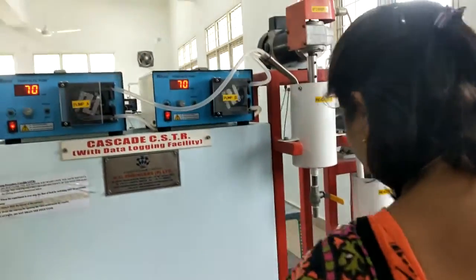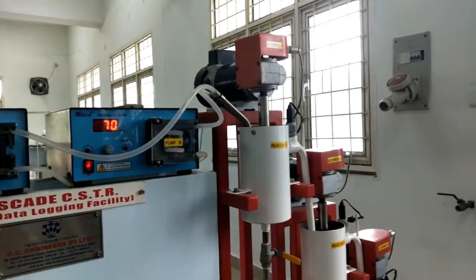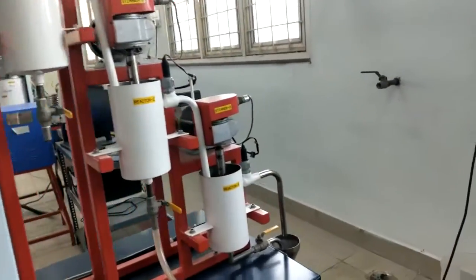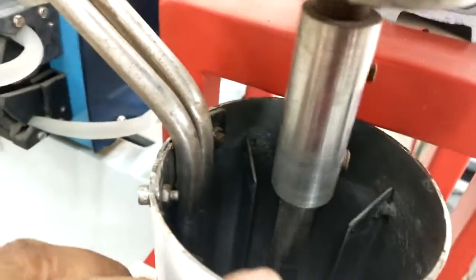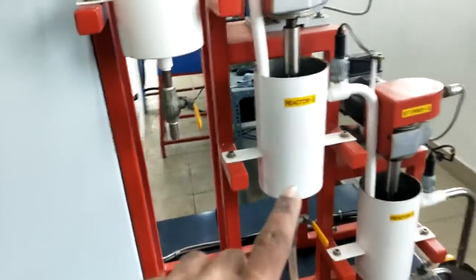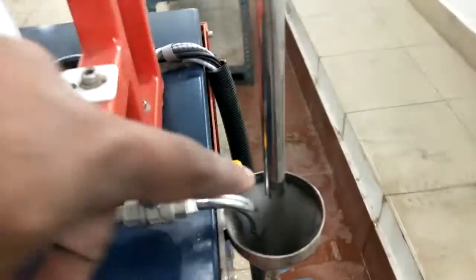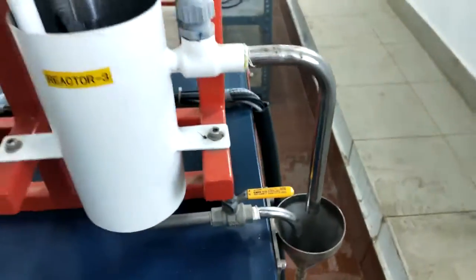And we will just wait for another, because the higher the speed, last time it took 10 minutes. We may be getting the steady state within 7 to 8 minutes. That means again, from the fresh tank, tank 1 has to get filled. Similarly, tank 2 has to get filled and tank 3 has to get filled. Then only we will have the flow rate of the reactor.